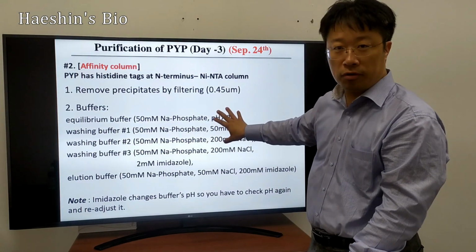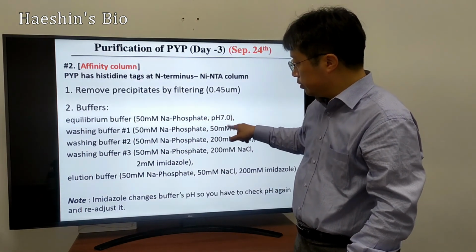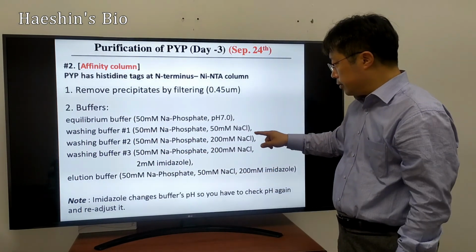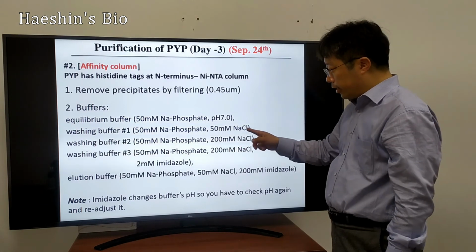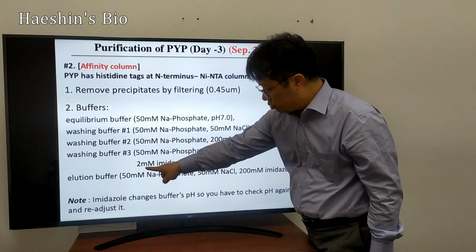basically several buffers. So that is equilibrium buffer, sodium phosphate, pH 7, washing buffer number 2. So basically what is this difference is the sodium chloride concentration is different. And then it becomes higher and it's the same, but now you have a 2 millimolar imidazole.